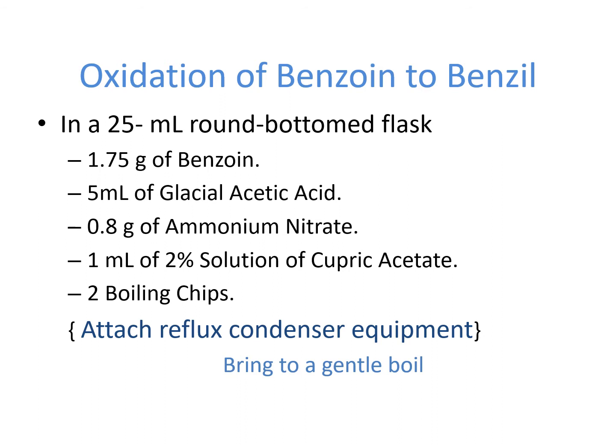Boiling chips actually are stones, and if you cannot find stones in the lab, you can also use broken glass, because that will help protect the setup from explosion.